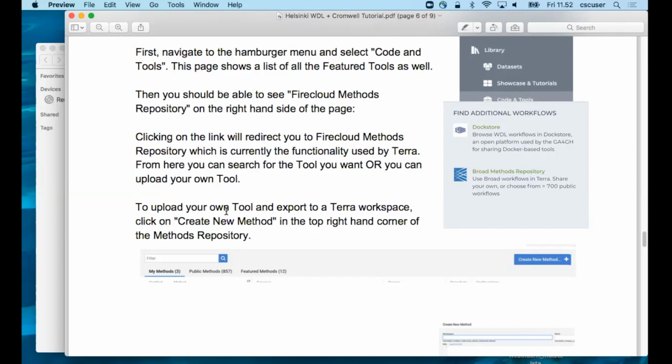So you have the jars file, you have the hello WDL, hello GATK. There's another folder called Terra. You have that Terra WDL in there. Upload that. Everybody good here?